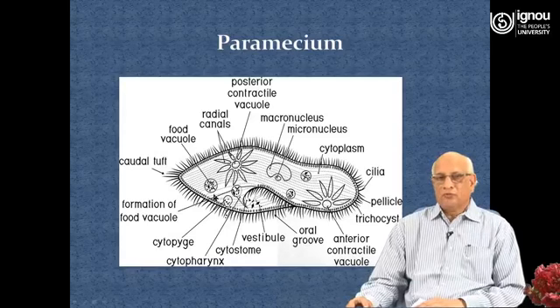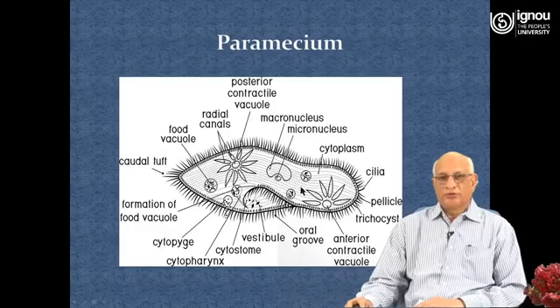At the time of movement, these food vacuoles change their pH. Initially it is acidic in nature, and then it is basic, and during the journey of this food vacuole, the food is digested. After the digestion, it is assimilated by the protoplasm. The digested food particles move from the food vacuole into the protoplasm, so all parts of the protoplasm get the nutritive substance.